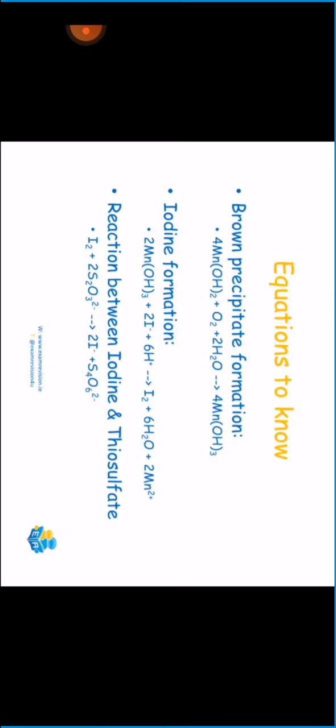So this slide here summarises everything that we've spoken about so far with our additions to our bottle through balanced equations. The first equation here shows the brown precipitate formation, where the manganese hydroxide reacts with the oxygen to produce manganese 3 hydroxide. The second equation looks at the iodine formation, where we have our concentrated sulfuric acid allowing our iodine to be liberated. And this last equation here shows the reaction between the iodine and the thiosulfate, which will happen once you do your titration.